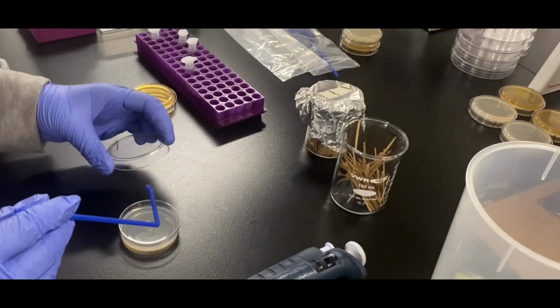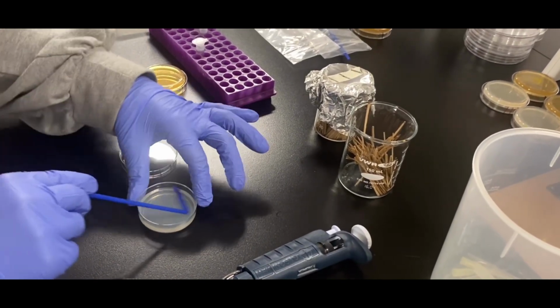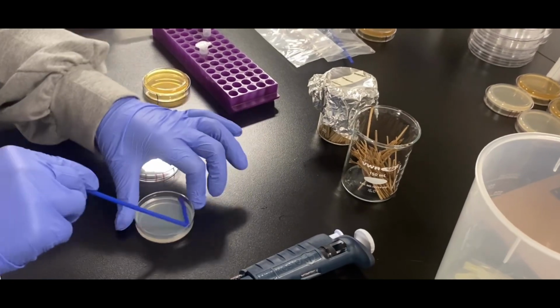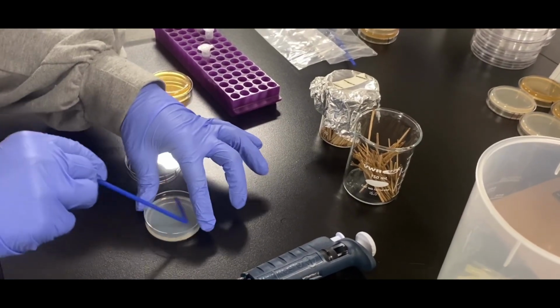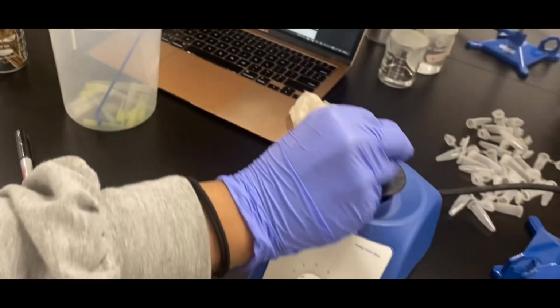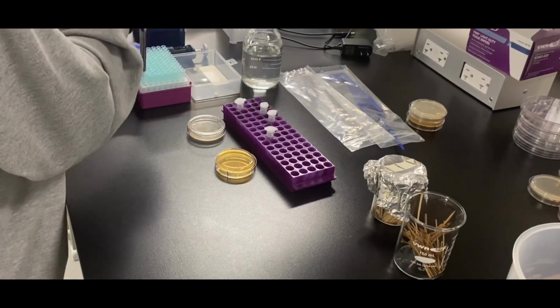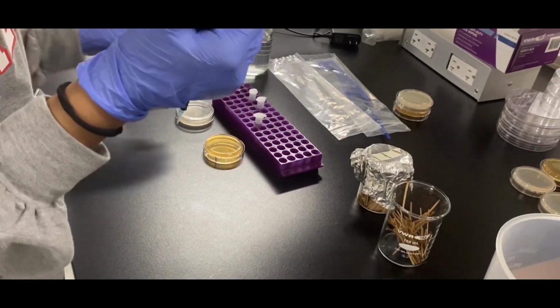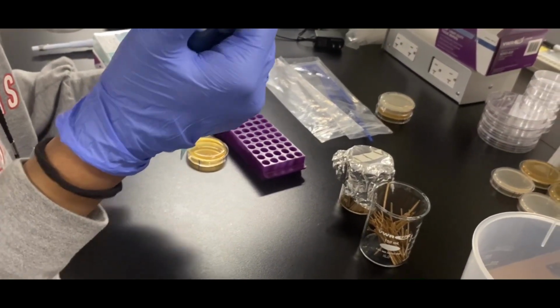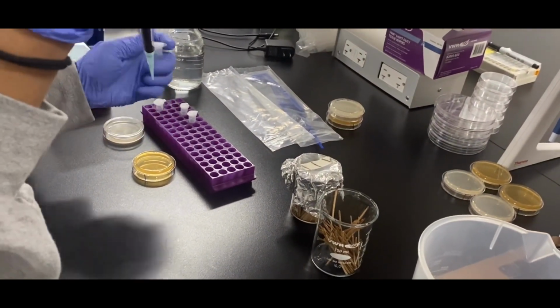Using a sterile spreader, slowly rotate the plate with one hand while moving the spreader up and down the plate lightly to evenly spread the material onto the plate. Next, vortex tube number 4 and once again adjust the P200 micropipette to 050. Attach a fresh pipette tip and add 50 microliters of the content in tube 4 onto the YPD plate.